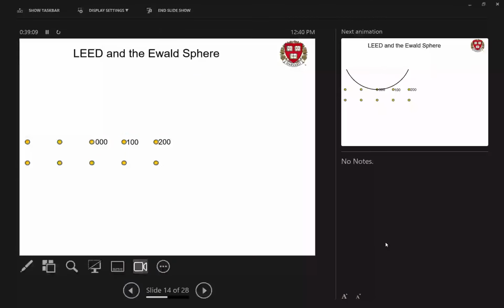There is going to be one bit of terminology I'm going to point out here for people who are really familiar with diffraction. There's this concept when you take a diffraction course or many microscopy courses called the Ewald sphere, and they'll teach you about it and then you'll never use it because you generally don't need to. What the heck is this?